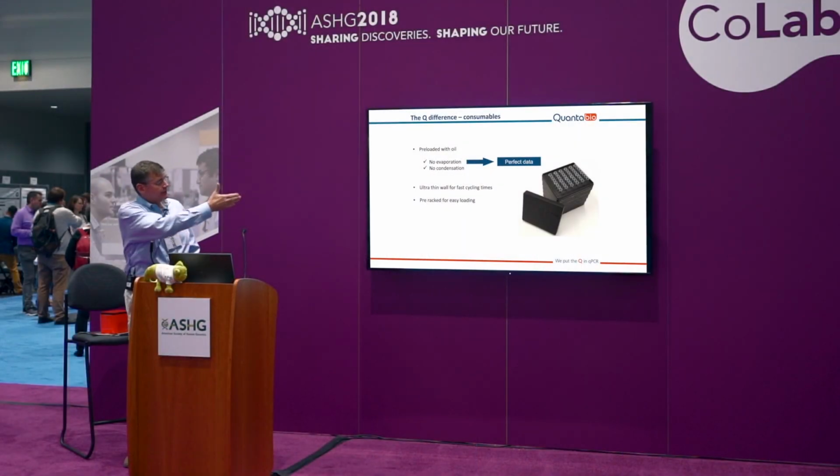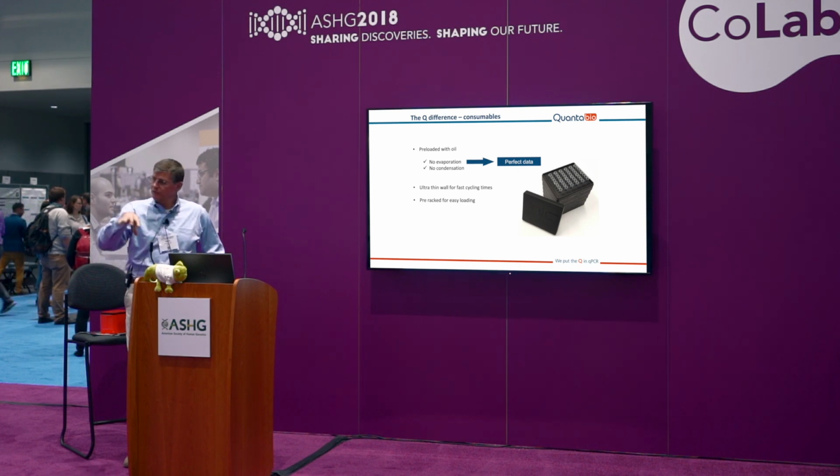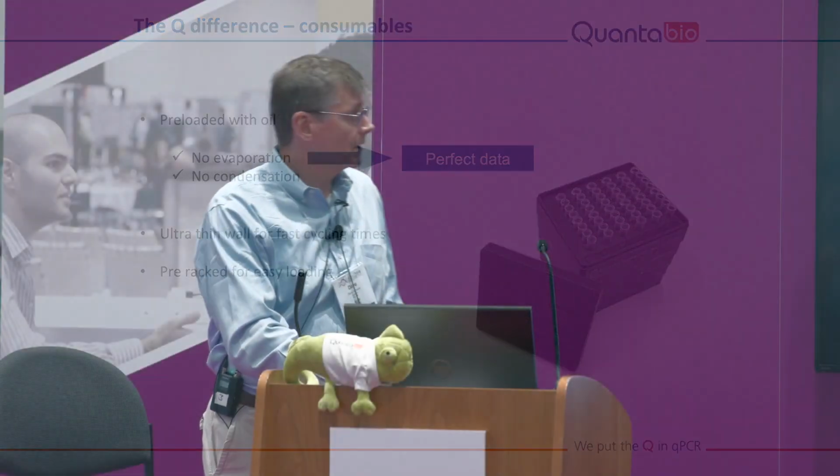The other part that's unique is really the reaction tube that is used for the device. It can be a bit of a mindset change. It was for me initially when I started working with this, but having the tubes arrayed in a typical fashion, and then the software is designed so that you can load these and it'll translate the sample ID to the proper location in the rotor. But it's the tight fit. There's oil over this, so when you add the sample and there's a cap that goes on and then you spin it, the sample becomes overlaid with oil, very much like the original days of PCR, but it provides for much tighter sample volume uniformity from sample to sample, and there's no evaporation.